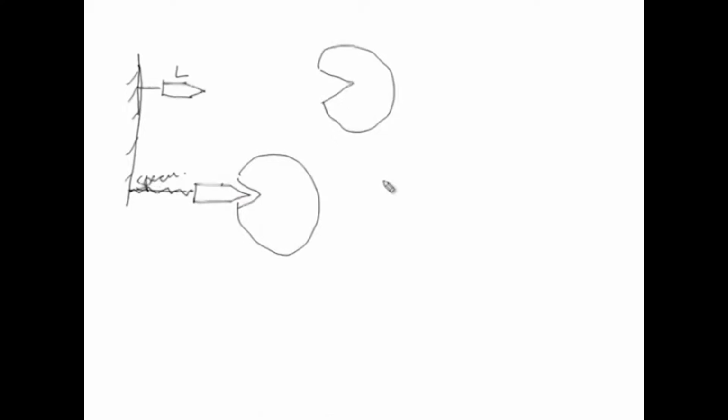Now, here the affinity has to be good enough in the sense that it binds specifically, and non-specific binding could be avoided, and it should be reversible also, so that you can elute the sample. So, once it is bound, the second step would be to wash the contaminants and then elute this protein. Now, elution could be done by taking a free ligand in higher concentration.